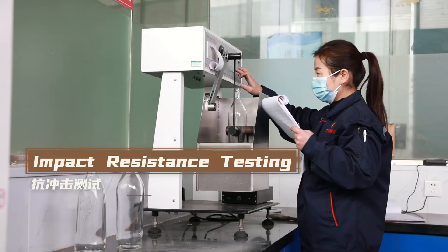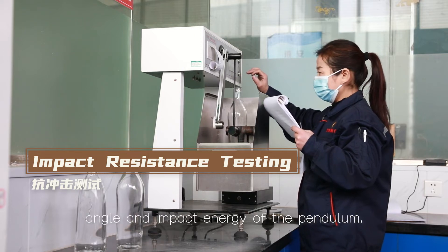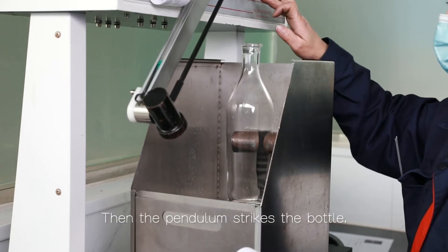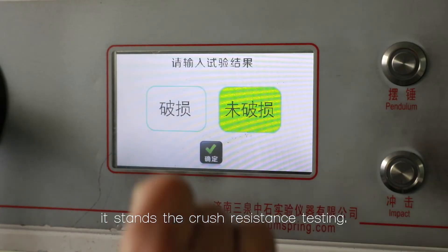Impact resistance testing. First we set the device with the right height, angle, and impact energy of the pendulum. Then the pendulum strikes the bottle. If the bottle remains unbroken, it stands the crash resistance testing.